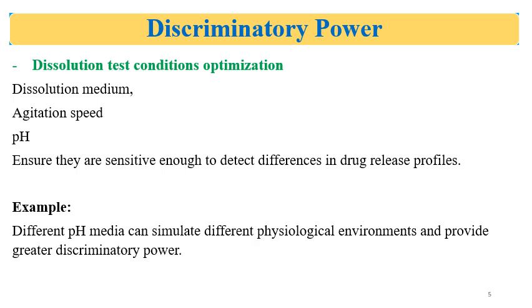The dissolution method test condition should not be giving you under-discriminatory dissolution results. An example is pH. Different pH media can simulate different physiological environments and can give you greater discriminatory power.